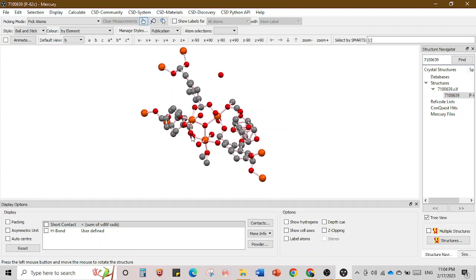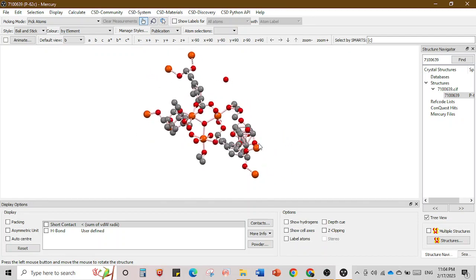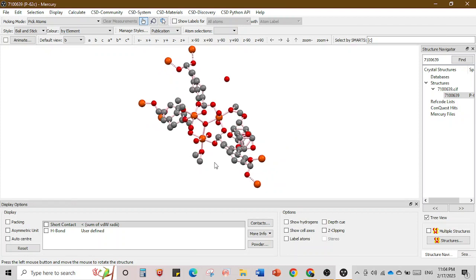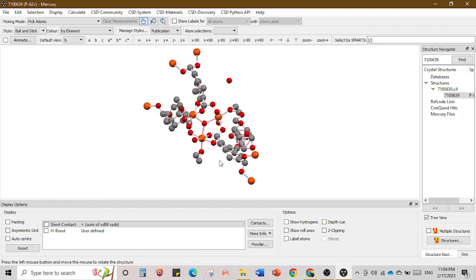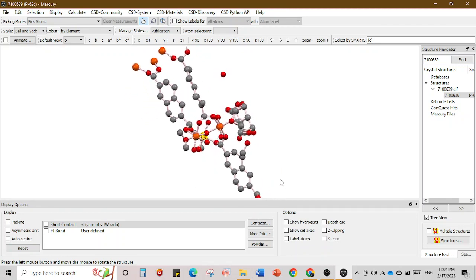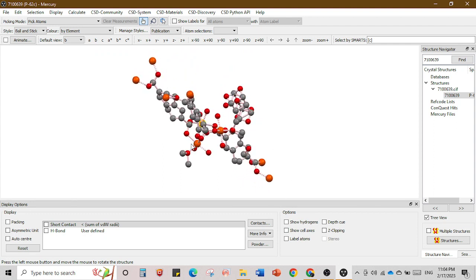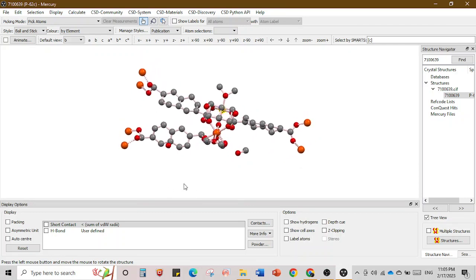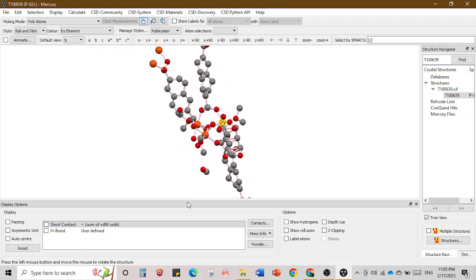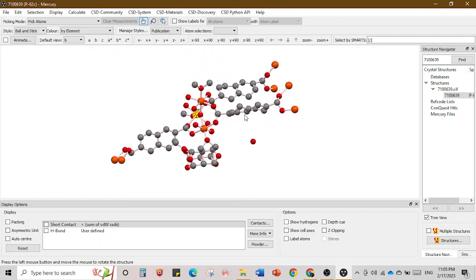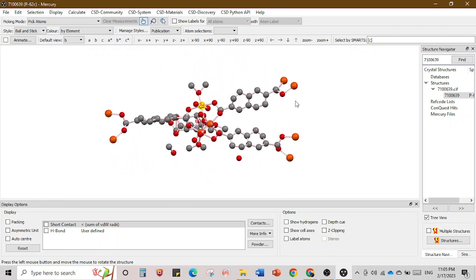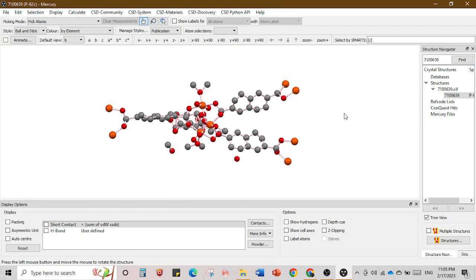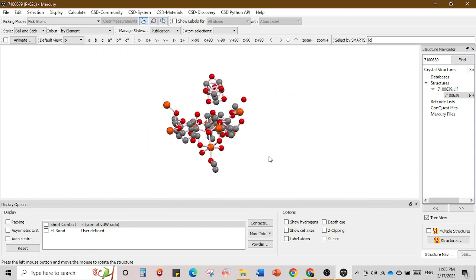You can see that iron is six-coordinated — there are four equatorial atoms in a square arrangement, and this is bipyramidal, so it can be called octahedral or square bipyramidal. Four are in the equatorial position and two in the axial position. You could also see the benzene dicarboxylic acid — or in this case I think it is naphthalene dicarboxylic acid, so the crystal structure we downloaded may be MIL-88D.